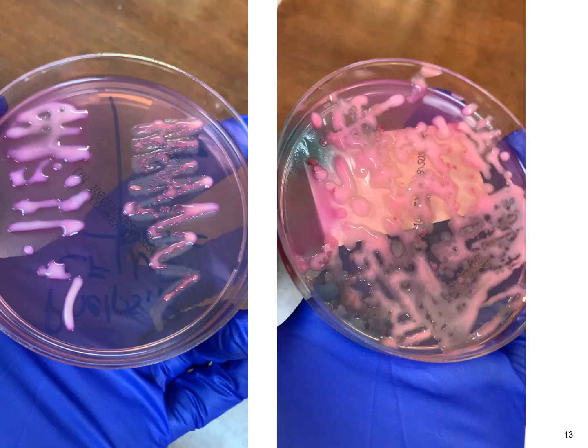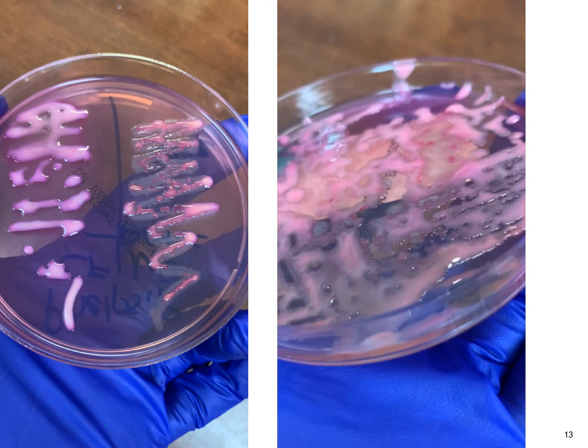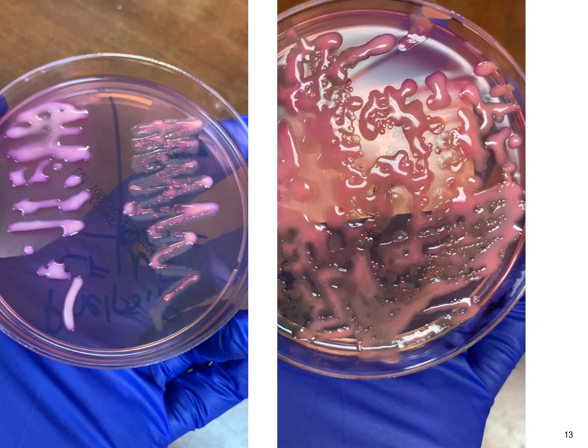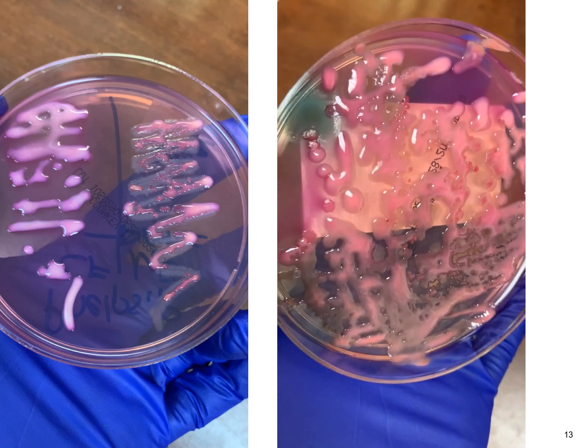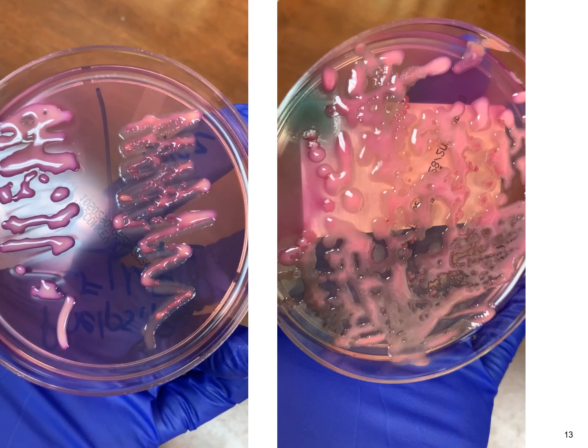With these organisms, you have a mucoid look. And so these are the same organism, but where I mentioned earlier where you can have some variations in how the organisms respond. So if you tilt those plates, you can see how mucoid those organisms appear. And you can see where it's also fermenting that lactose, so you have that real pretty purplish color with all of these organisms.